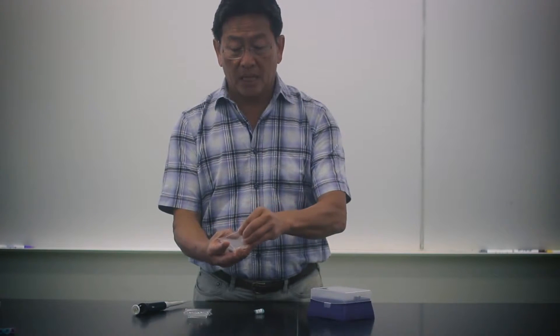So you peel this back, and you will need a black surface to do this to make it visualize better. We use the black surface on this laboratory bench, and we come with a dye that will allow you to practice and a pipette that is a 2 to 20 microliter pipette that comes with the Mini One.